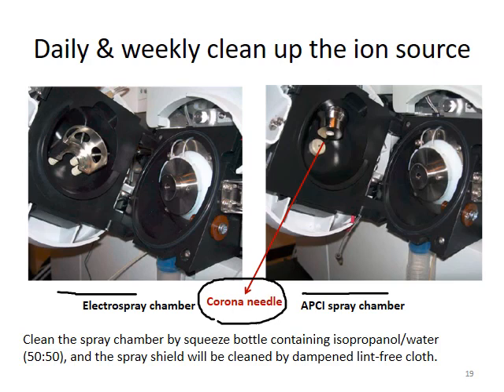To clean up the source chamber, a typical method is to prepare a mixture containing 50-50 isopropanol and water, IPA water, in a squeeze bottle. You may squeeze the solvent mixture to clean up the parts. You can clean up the parts on your left.